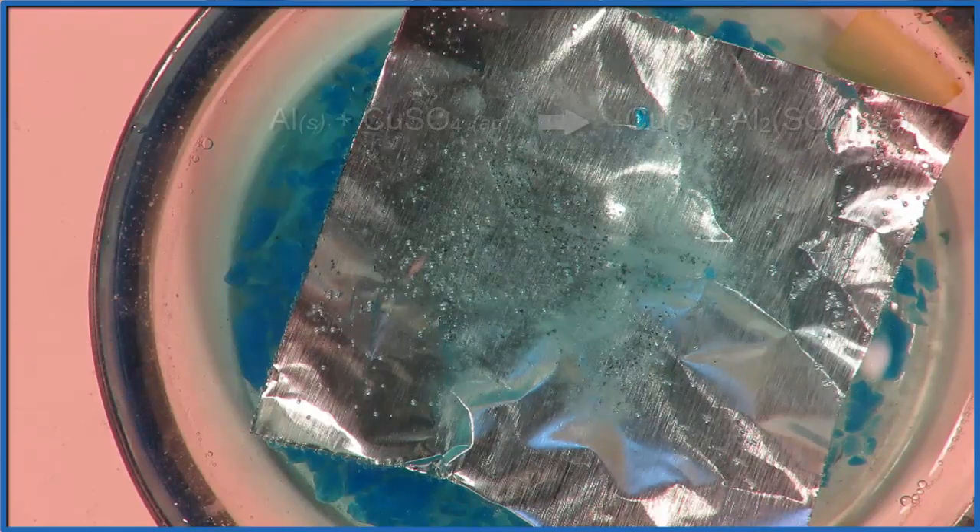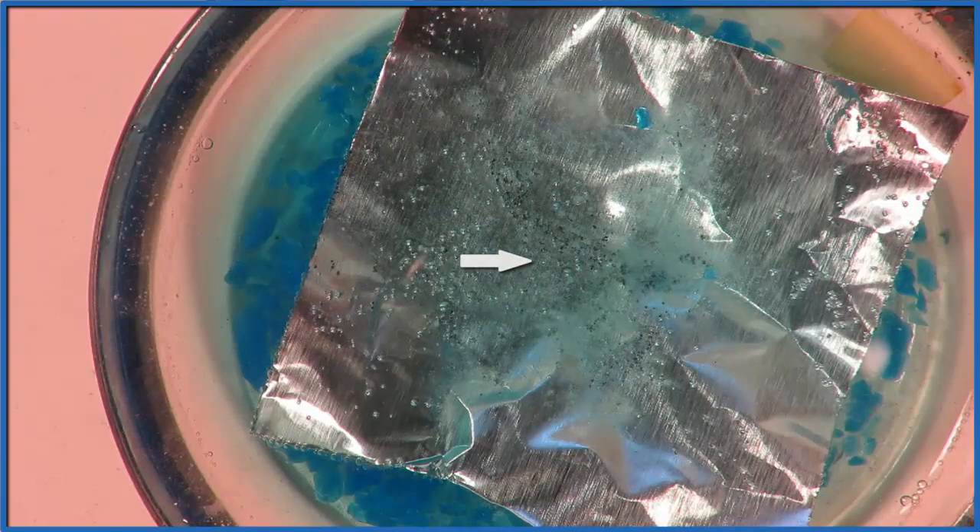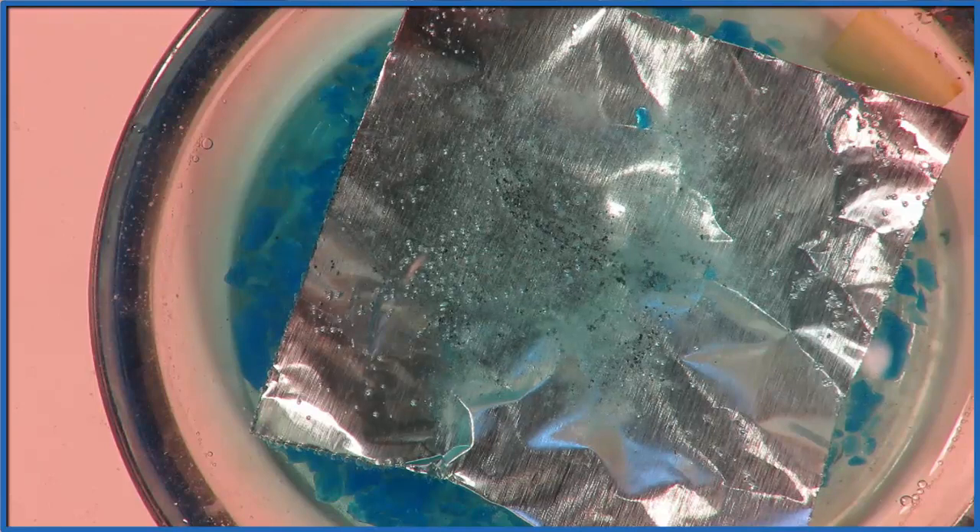There you see those black dots, those dark areas, where the copper forming there is a solid — solid Cu — and the aluminum, Al, is dissolving. It's becoming Al3+ and going into the liquid there.